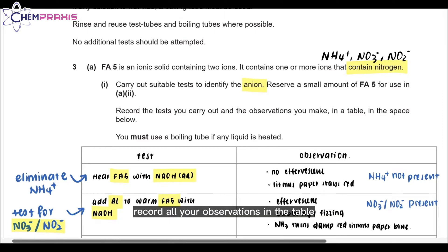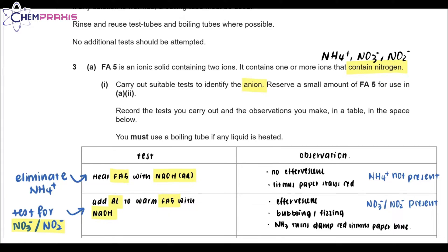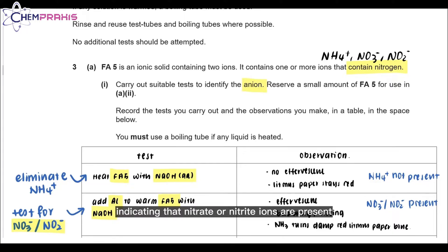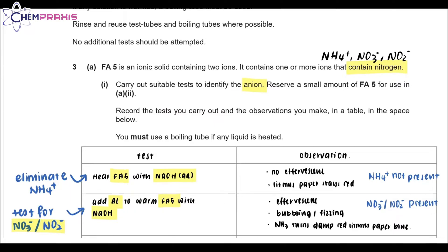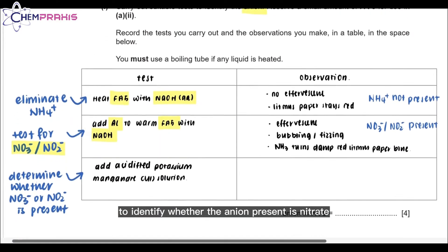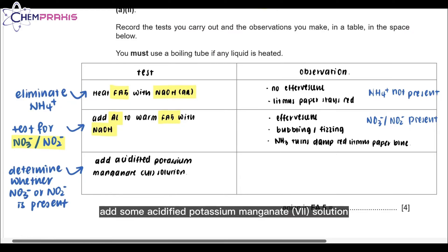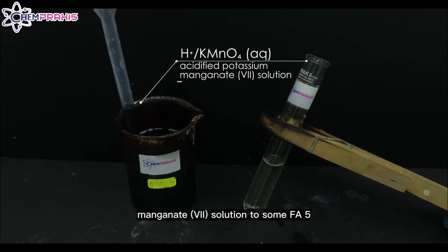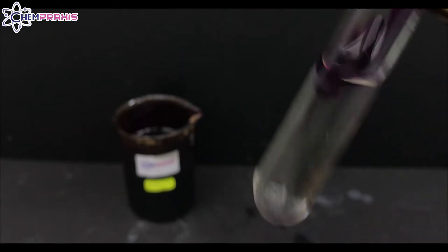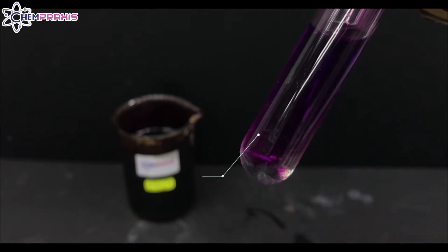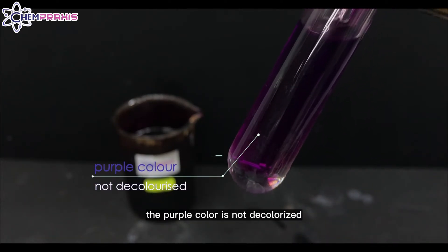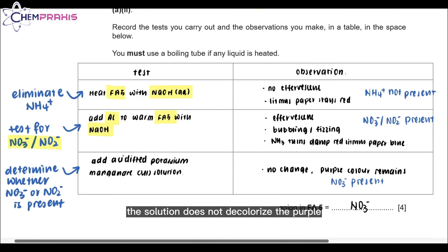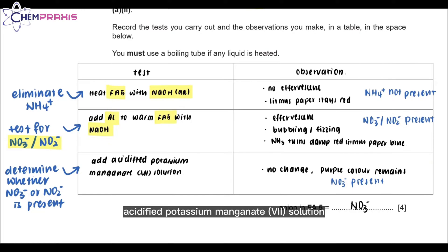After heating, the litmus paper still stays red, and the ammonia gas produced turns the red litmus paper blue. Record all observations in the table. For the first test, no gas is produced, so the ammonium ion is not present. In the second test, ammonia gas is produced, indicating that nitrate or nitrite ions are present. To identify whether the ion is nitrate or nitrite, we'll add some acidified potassium manganate solution. The purple color is not decolorized, so we know that the nitrate ion is present.